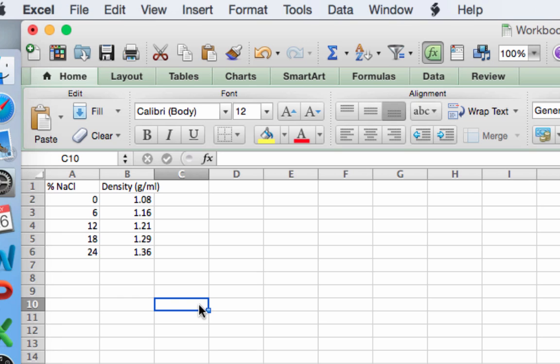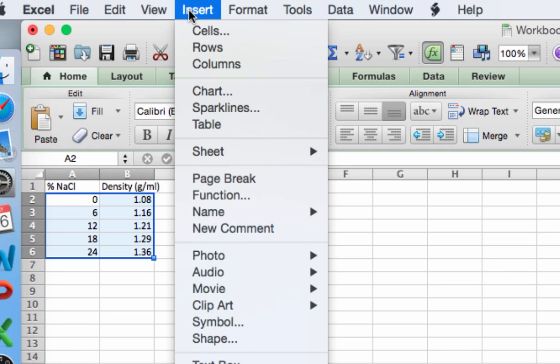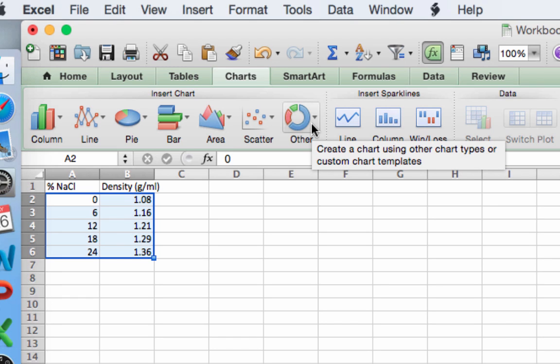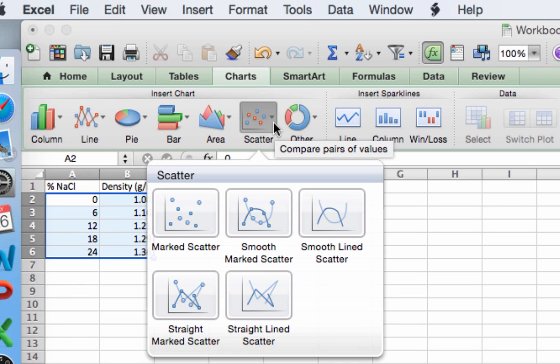So to make the standard curve in Excel, begin by moving your cursor to the upper left most data point, and then click and drag down the column and across to the next one so that you've highlighted all of your data. There are many ways of creating the chart using the different Excel platforms, but I'll use the one that's the most common between all of them in my demonstration. So I'll go to the top of the screen where you see Insert, click on Insert, and then choose Chart. You'll see that on my screen a number of chart options have popped up. This may come in a separate dialog box in your version of Excel, but the point is the same that we would choose from all of these graph types a scatter plot. Scatter plots are graphs where you simply get a point added at each of your data points. Choose the one that does not have any lines going through it as these lines are not true trend lines but rather connect-the-dot type lines. So we'll choose simply the marked scatter plot.